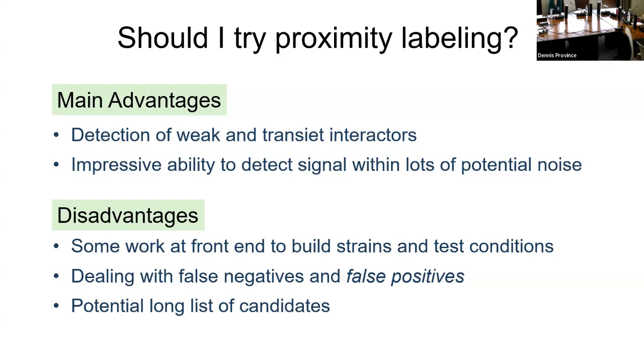The proteins I'll tell you about that we've looked at are only expressed in one tissue of the whole worm. We can't dissect it out. The worms are 1 millimeter long, right? And they're not expressed at very high levels, so it's a pretty low proportion of the total lysate. It's like you took your cells of interest and diluted them with a bunch of other garbage, right? And you still get the signal out. So that's what we're asking the system to do for us.